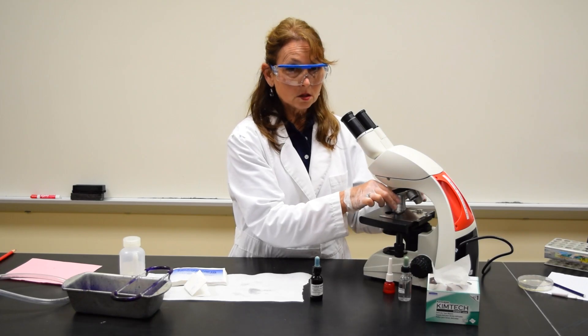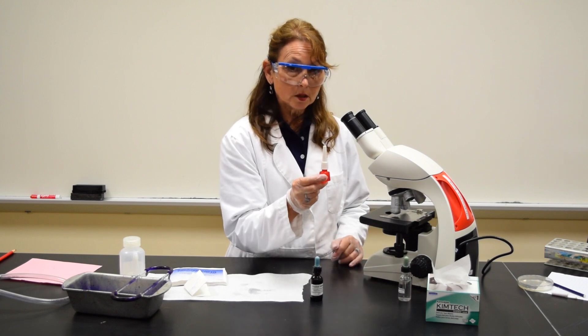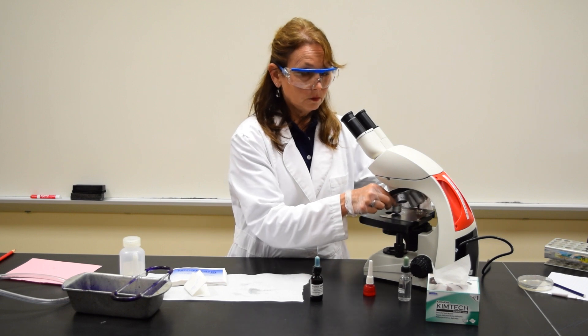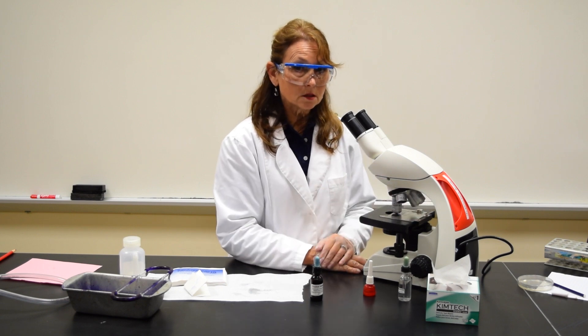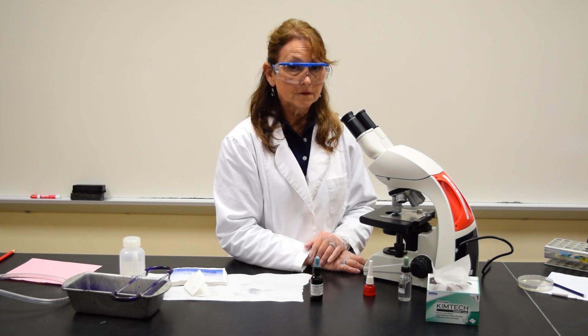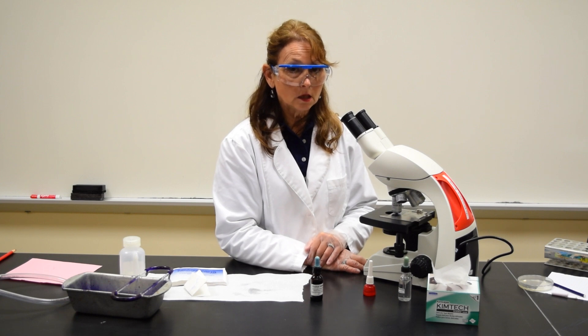When you're ready to use the oil immersion lens, you're going to put a drop of microscope oil on the smear and move the oil immersion lens in place. Make sure the lens is in the oil. Using the fine adjustment knob, focus on the slide until you can see the cells.